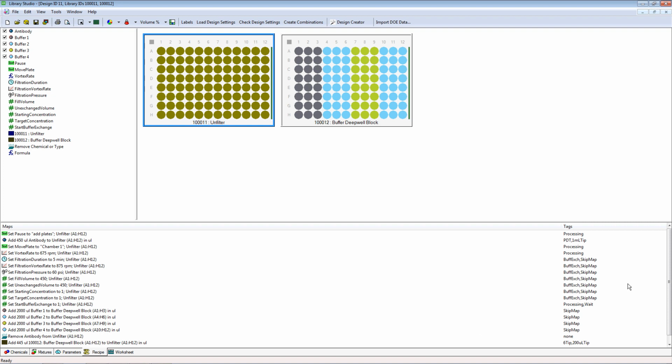So again, the intent here is to provide an alternate way for people to adapt to the software, to learn the software more quickly without the interference of trying to learn and remember all of the programmatic tags behind it. So that's LEA 9, that's Design Creator.